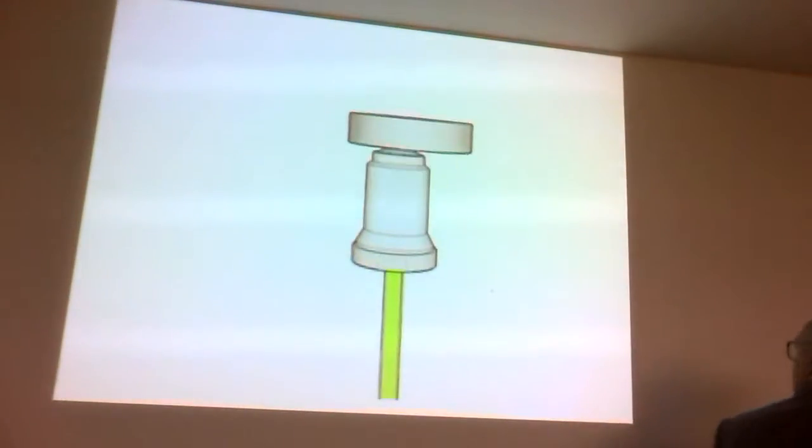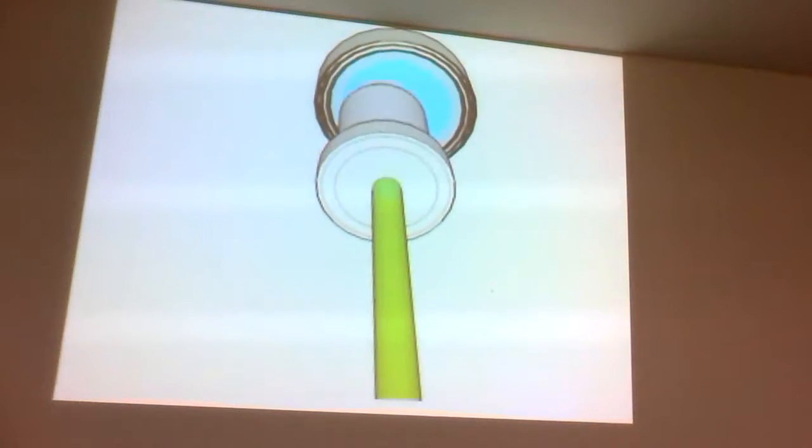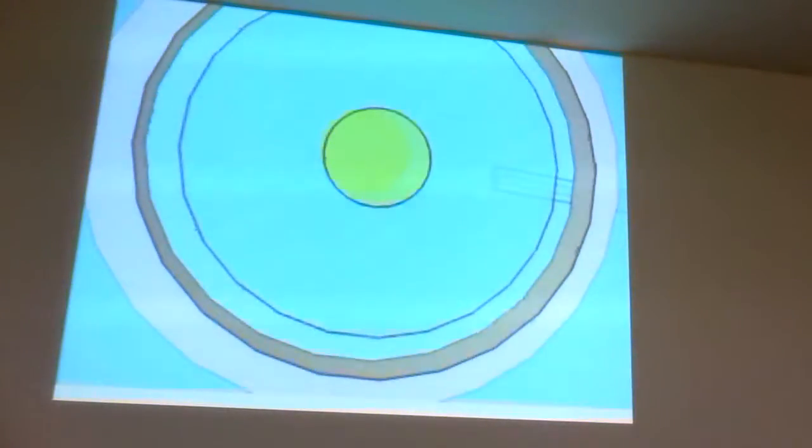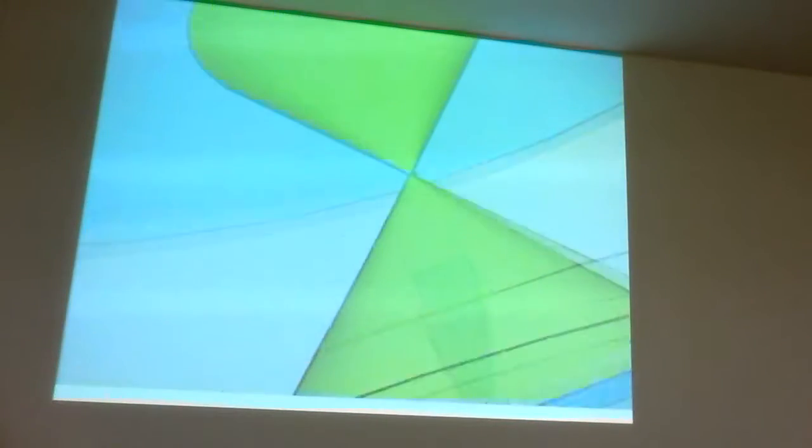What does this look like? Some more cool videos. So this is a Google Sketch to scale. I'm going to take a trip with a green laser beam through not a $35,000 objective. This one's a couple of $100s in our lab. We don't have $35,000 to spend on one objective like all this lab.